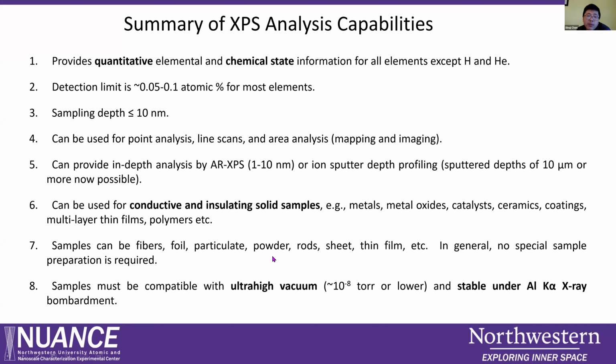And you can do any sample, like a powder. You can do powder or solid, but any sample has to be compatible with ultra-high vacuum, because all the analysis we talk about is done in ultra-high vacuum.